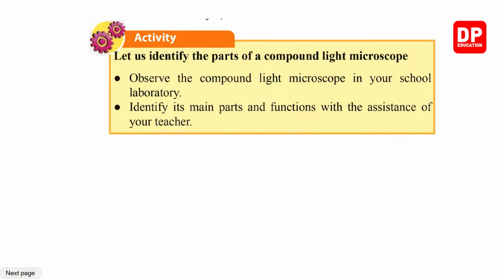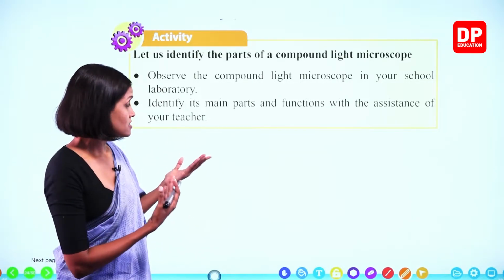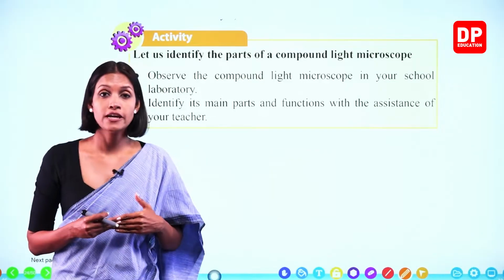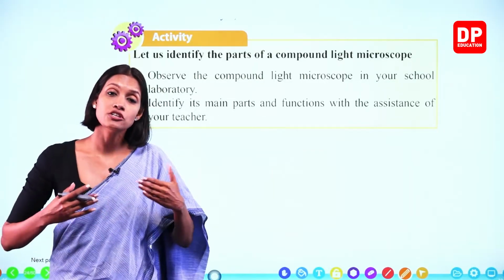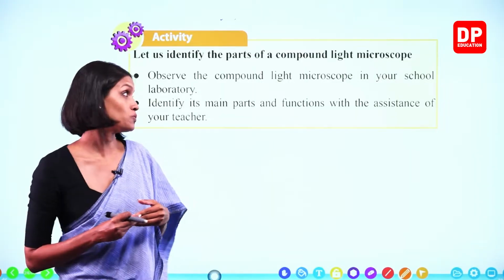Let us identify the parts of a compound light microscope. When we learn about the compound light microscope, this is an expensive instrument, so you have to handle it with care, right? In the lab, your teachers will also show you what the parts of a compound light microscope are, okay?